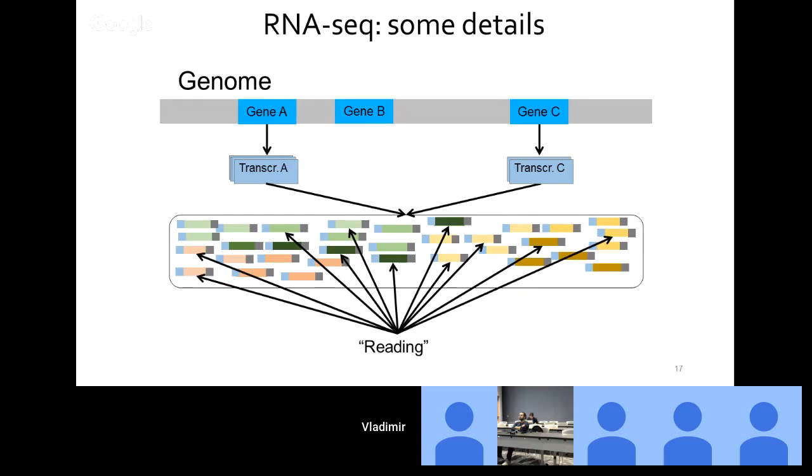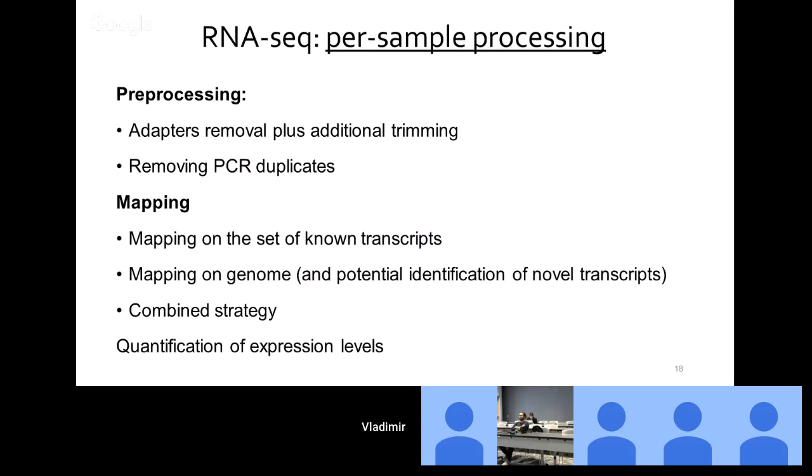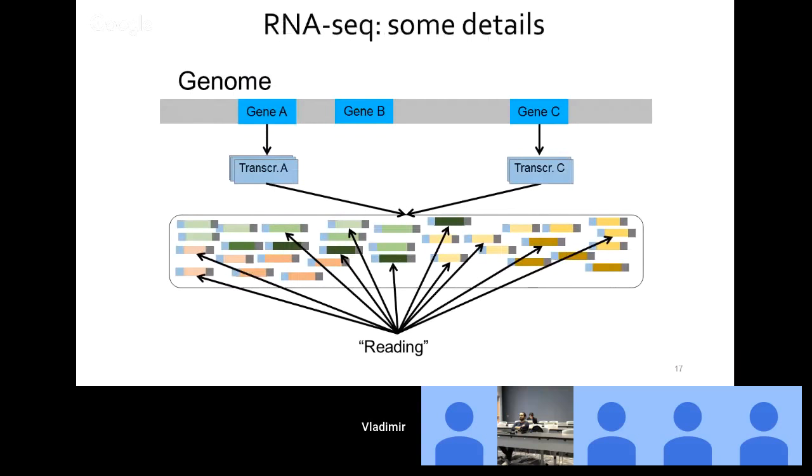However, if the initial amount of RNA material is sufficient, and if the number of steps in PCR amplification is relatively small, for example 6, 7, or 5, then the number of these artificial PCR duplicates, the copies read that originated from the same short segment, is relatively low.